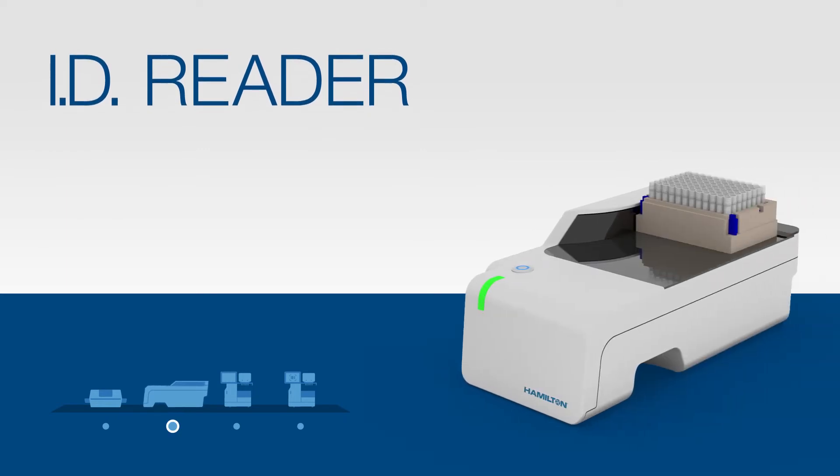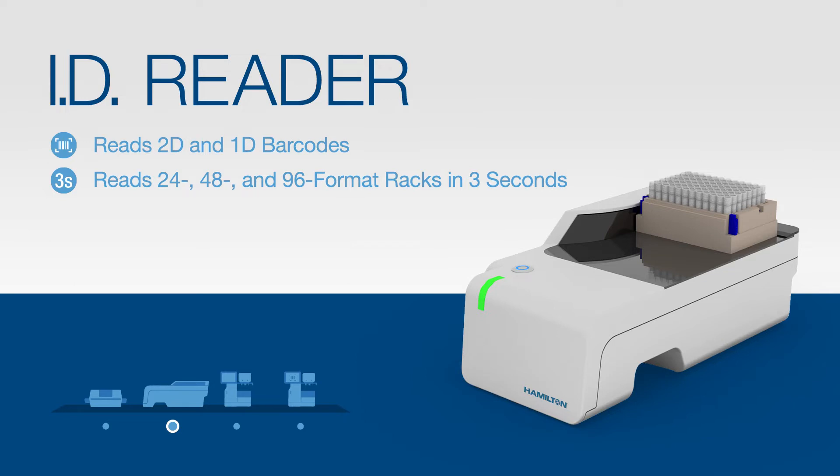Next, we have the LabElite ID Reader, a small instrument used to read 2D tube and 1D rack barcodes. The device features single-touch execution for high-speed 2D barcode reading on the bottom of racks. It can read 24, 48 or 96 format racks in about 3 seconds and 384 format racks in about 5 seconds. The ID Reader features configurable output options in CSV or XML formats for integration with LIMS or other systems for sample tracking.